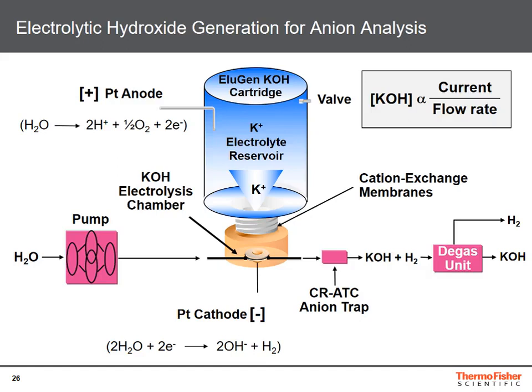In the upper right, you see that the generated hydroxide concentration depends very much on the applied current. The higher the current, the higher the potassium hydroxide concentration.